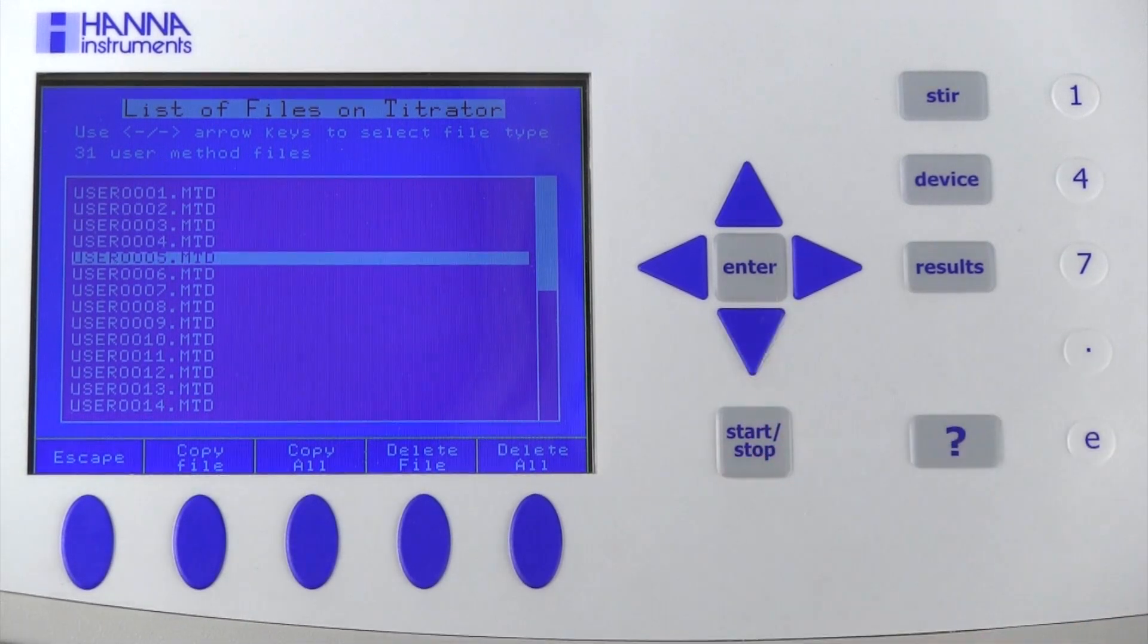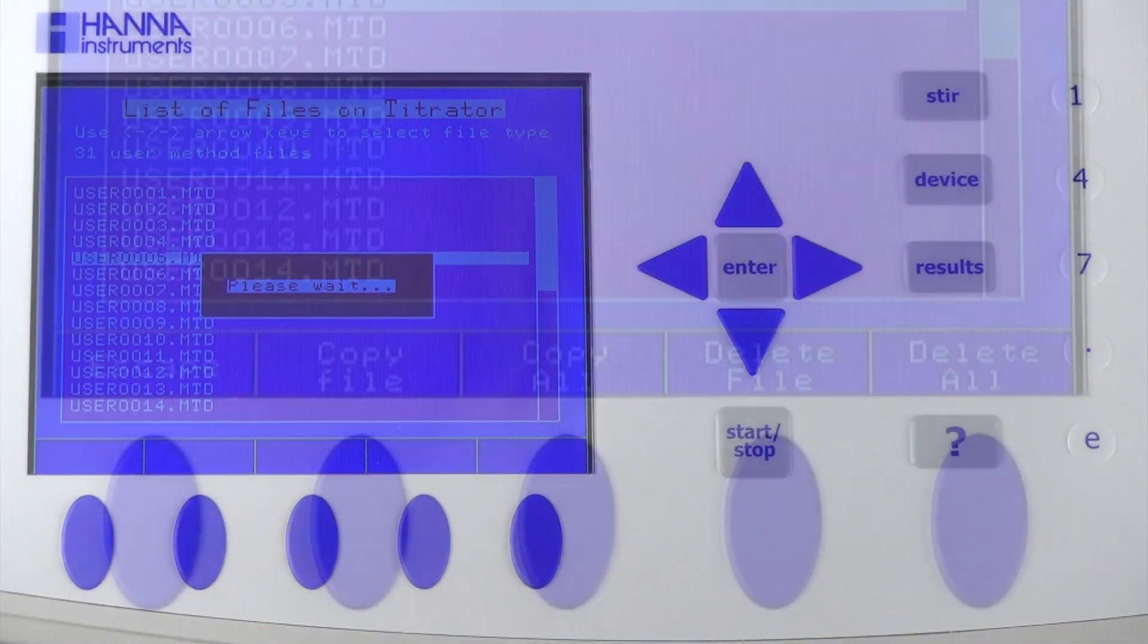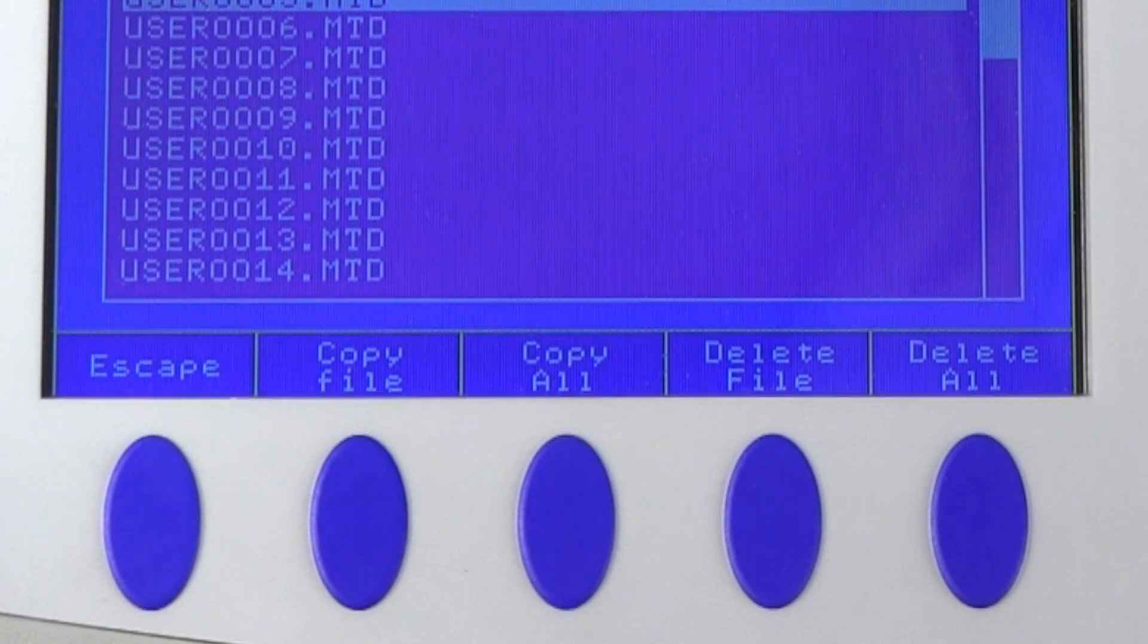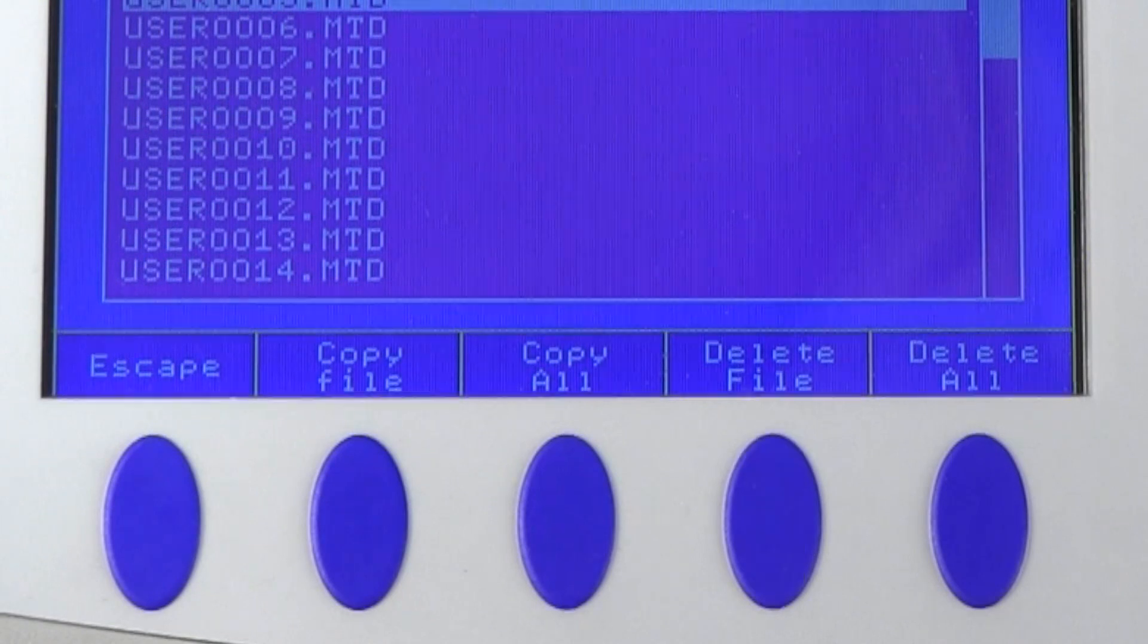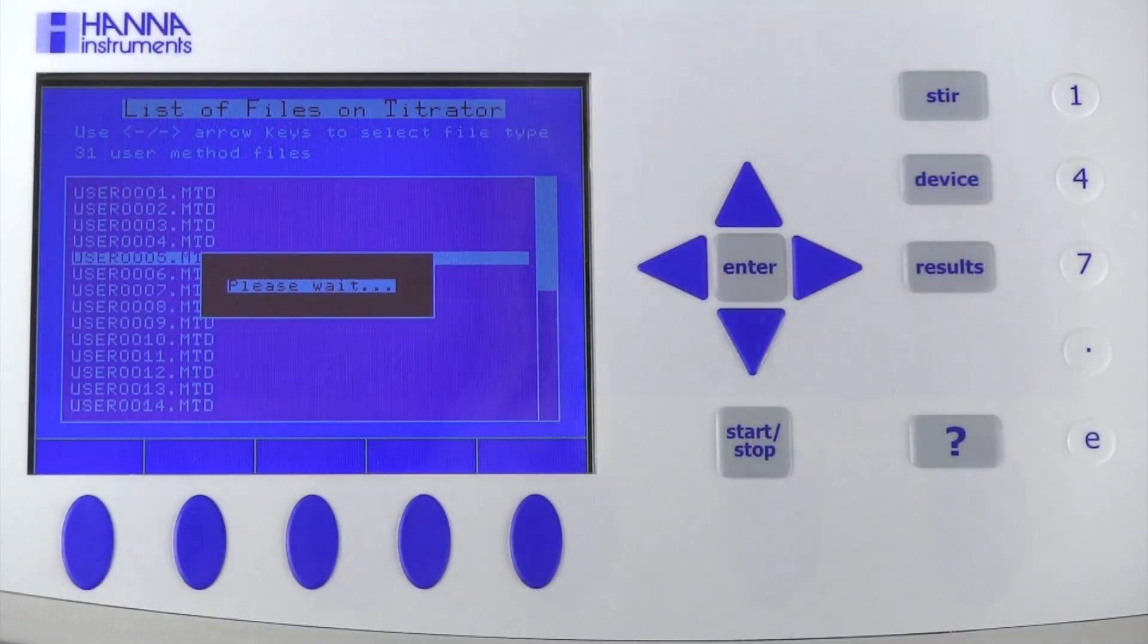After highlighting your file, press Copy File. You also have the option of deleting the file, copying all files, or deleting all files.